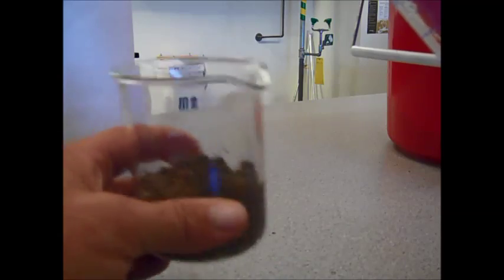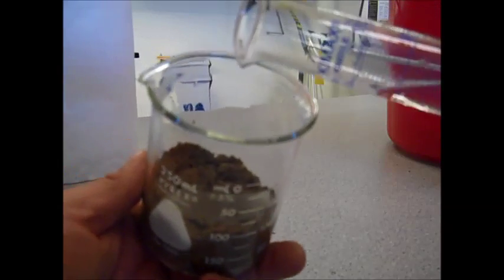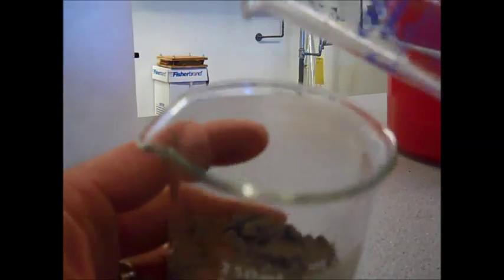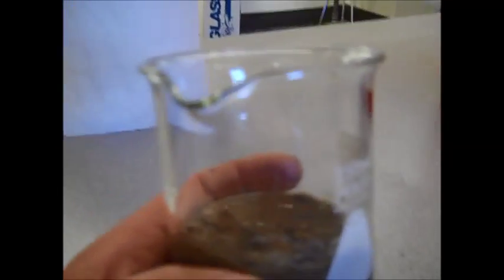I'm going very slow because the second I have standing water is the moment that all of the pore space has been reached to complete saturated capacity. Okay, we're getting close. And you don't want to compact the soil that's in here. We're starting to see water soaking in. This is probably going to be close. All of the water has soaked in, filled the pore space. If I added any more water, then there'd be standing water on top of this soil sample.